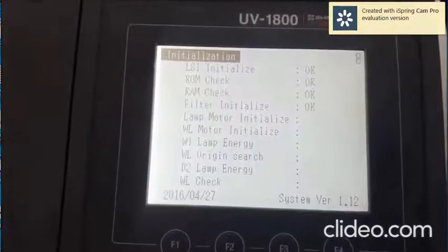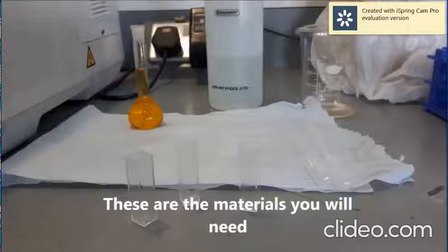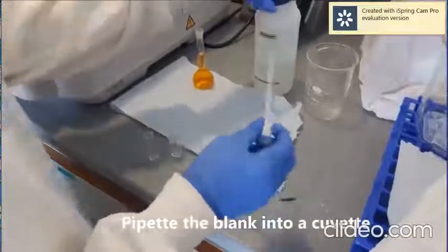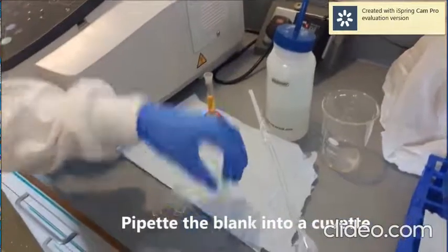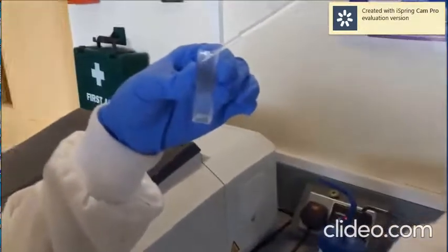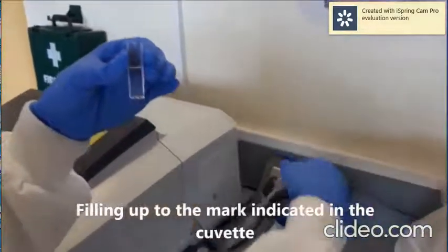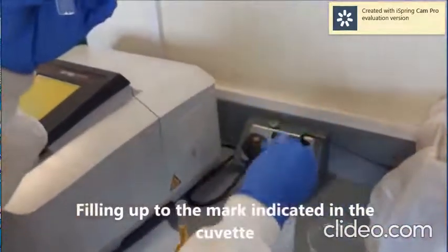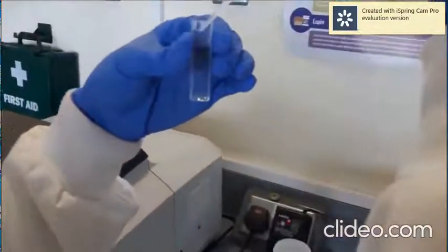Blank means here we have used phosphate buffer, so phosphate buffer will be taken as blank, and we have to put it inside the cuvette slowly up to 1/3 mark full, like that, as you can see. Now the cuvette has to be wiped properly so that the water on the outside is cleaned.